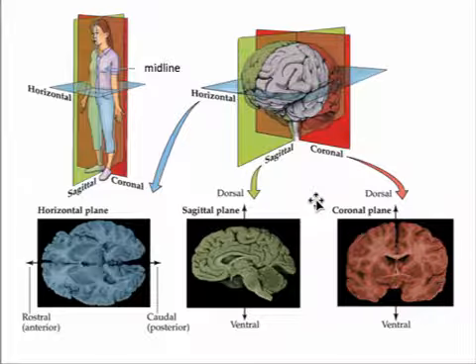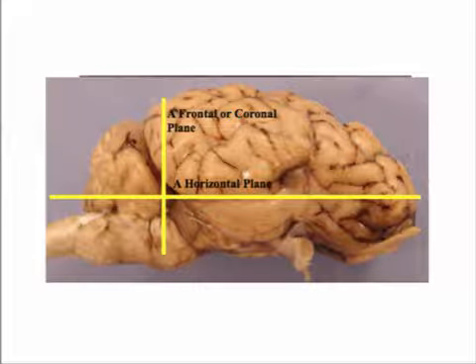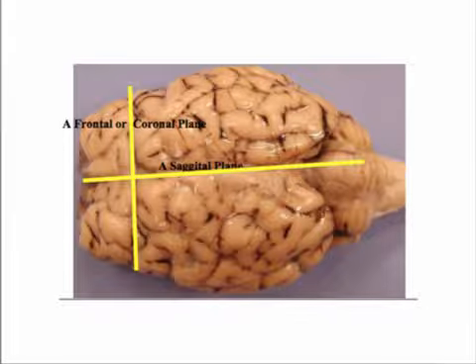Finally, the cuts that we'll be making during laboratory 3 are known as the coronal plane. These cuts would look like this on our sheep brains. So you have the coronal plane that would be made in this axis. Here's how you'd make a horizontal cut from the side of the brain. Our sagittal cut this week is made right down the midline like this.